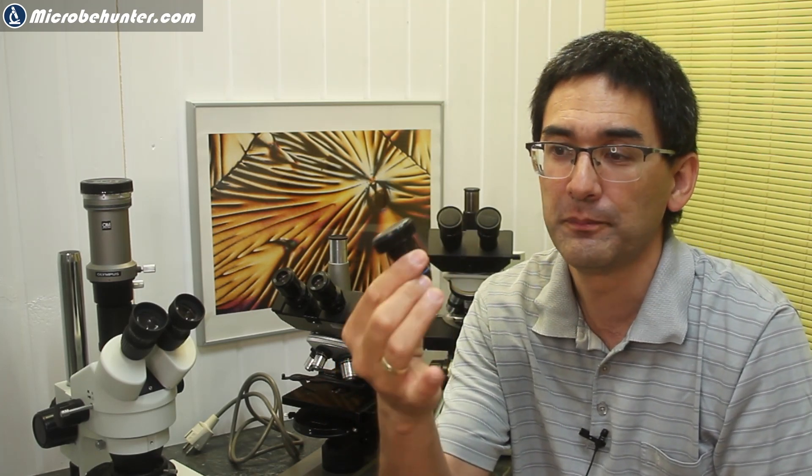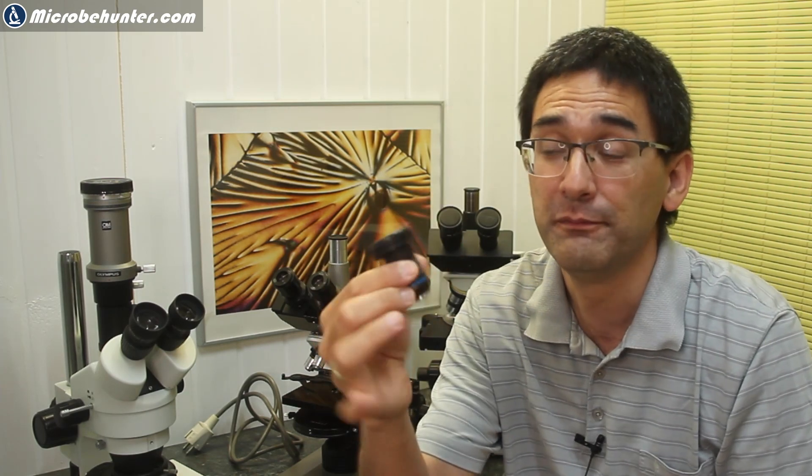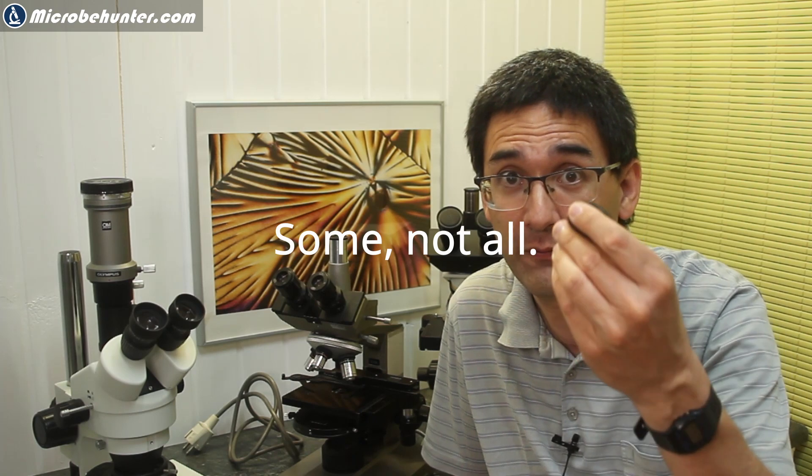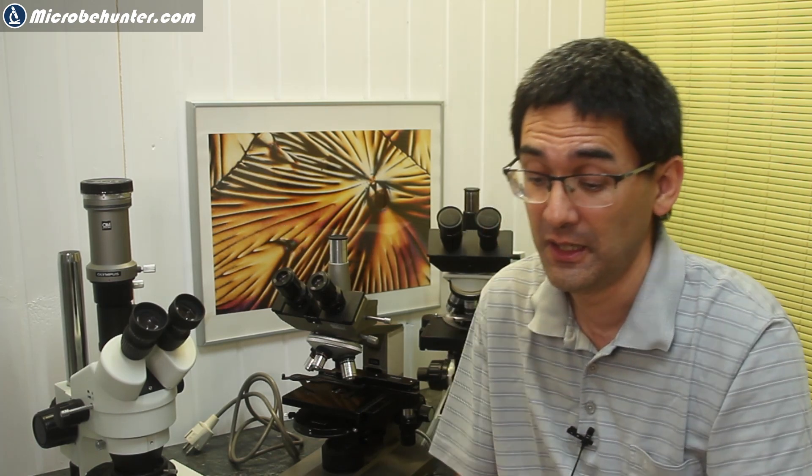These days, the most common standard is the one with the 195 mm. The 185 you still find in some older microscopes, and nowadays also in modern introductory microscopes.